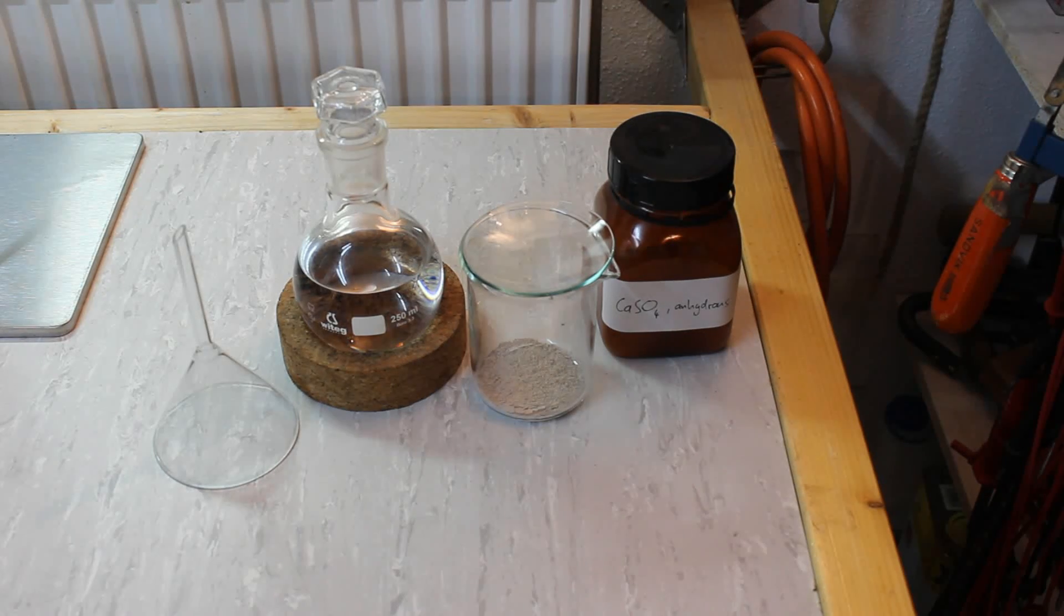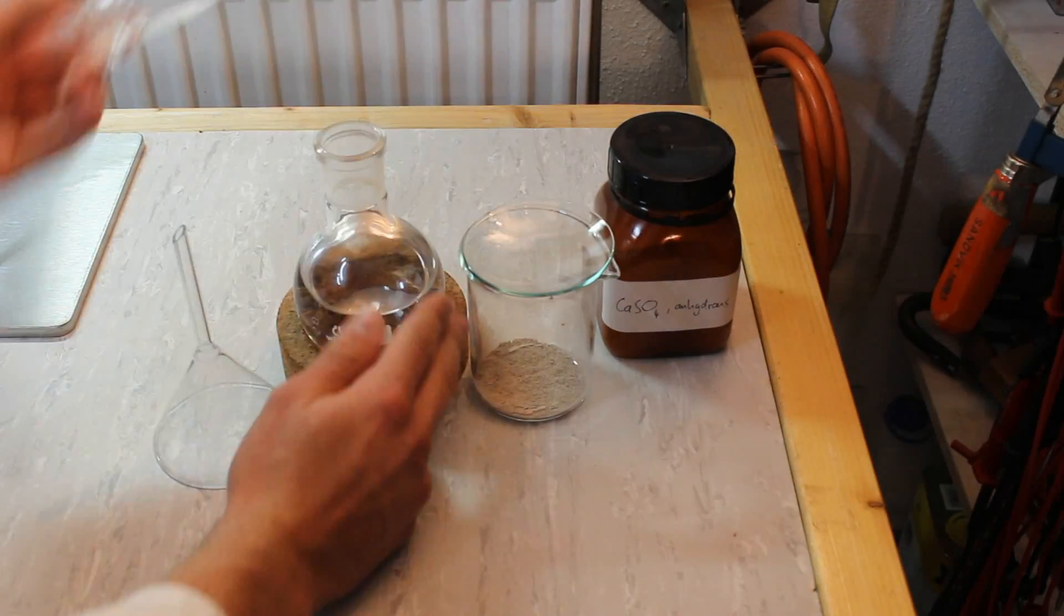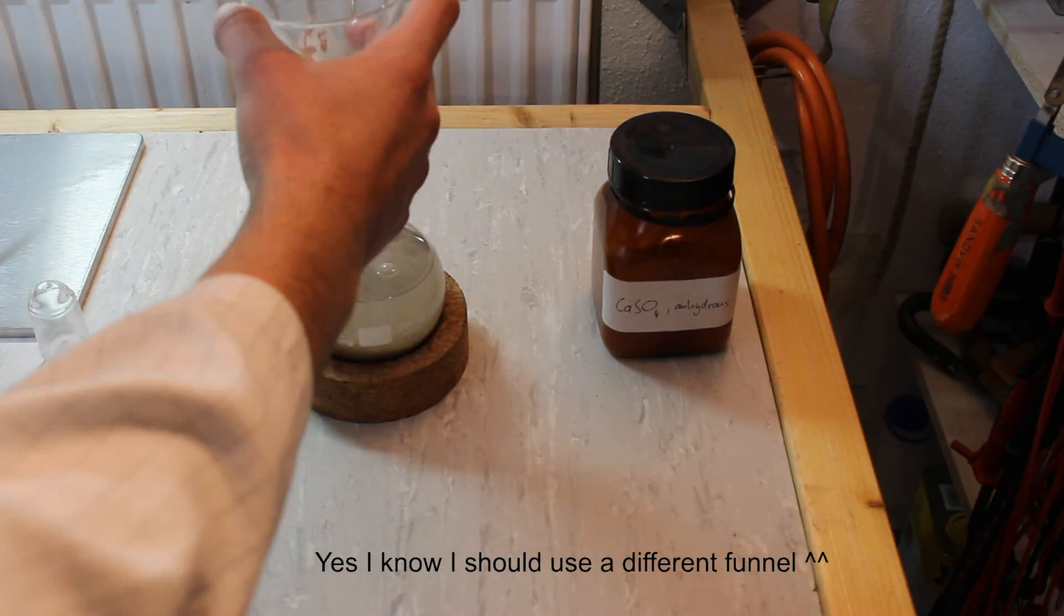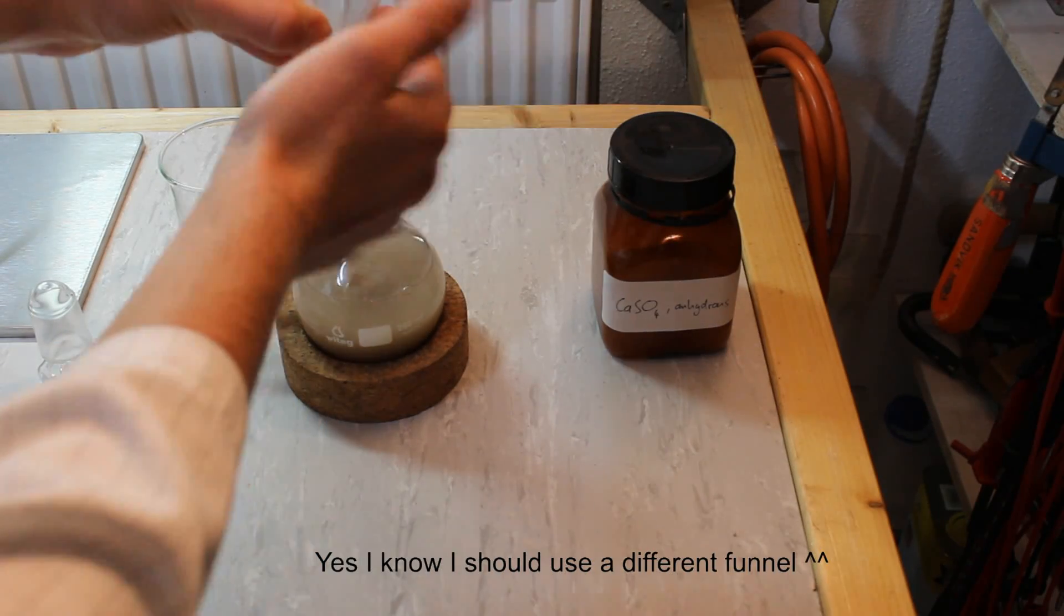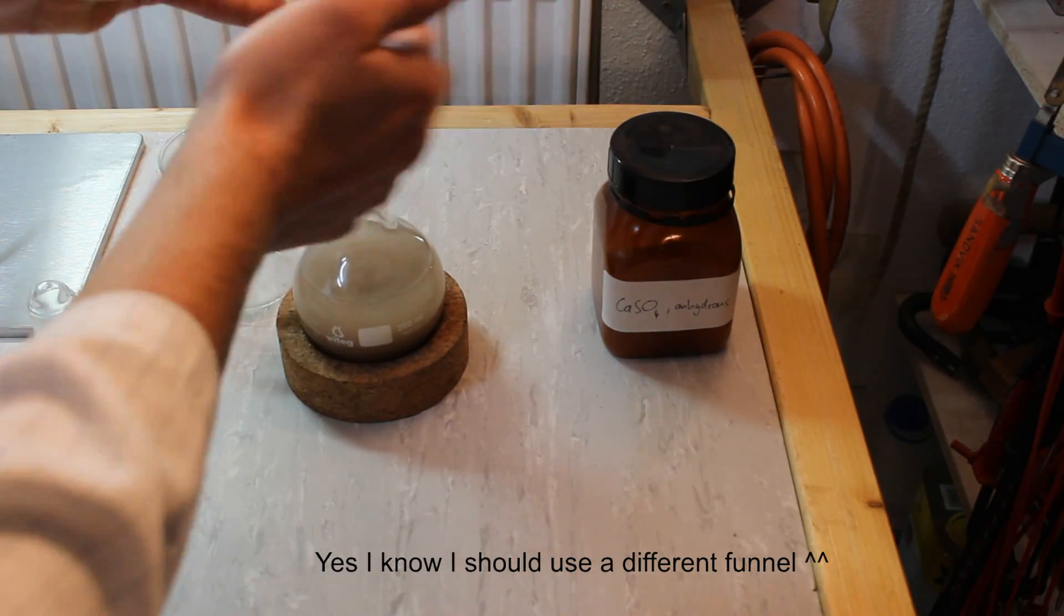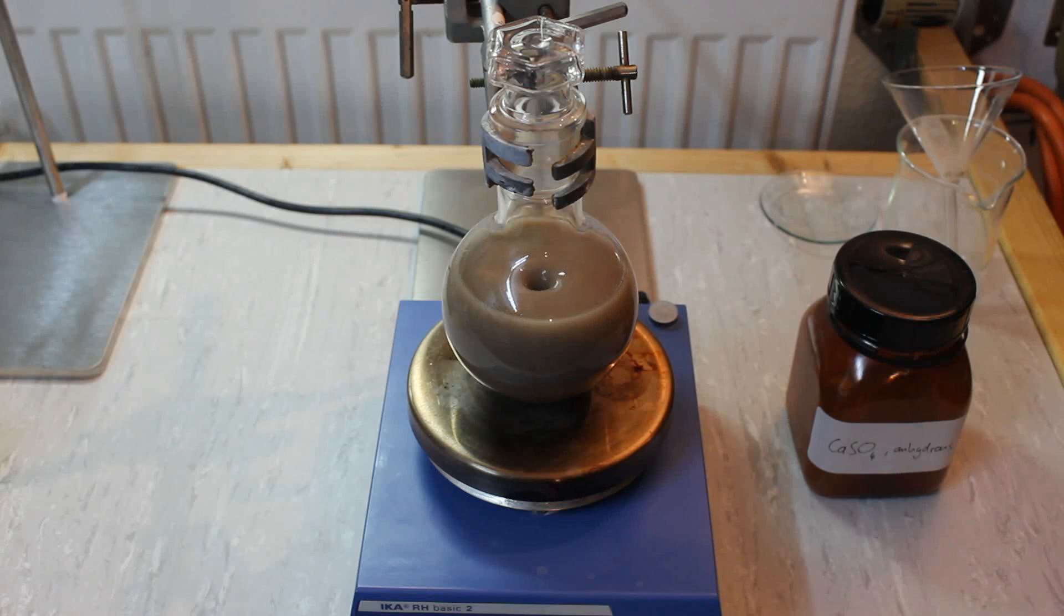So without further ado, let's add the drying agent to our acetone. I'm now going to let the acetone and the calcium sulfate stir for a couple of hours, then turn off the stirring and let the calcium sulfate settle to the bottom.